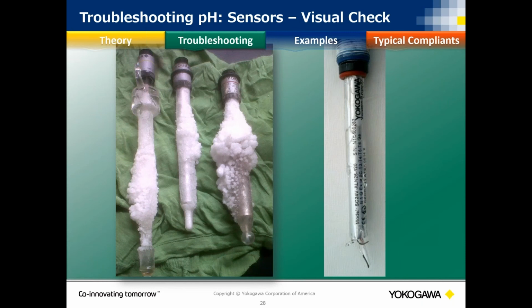Most instruments today have alarms, and what I find is people are actually turning off, or they have turned the alarms off because they were annoyances to them. They didn't know what they were doing. They didn't know how to interpret them. They were just going off.